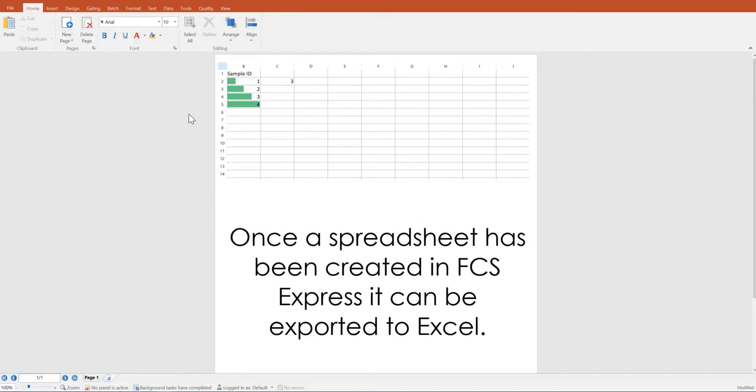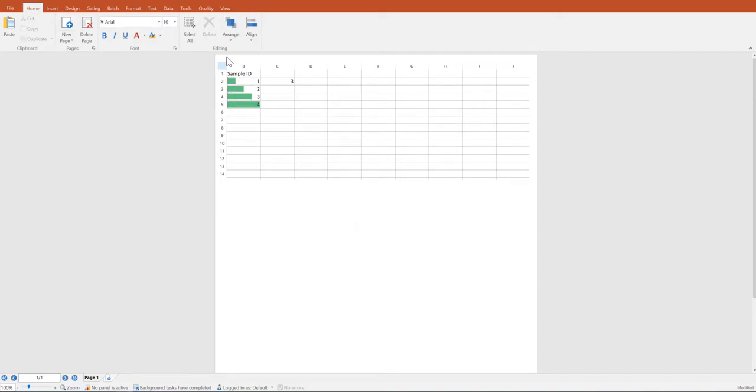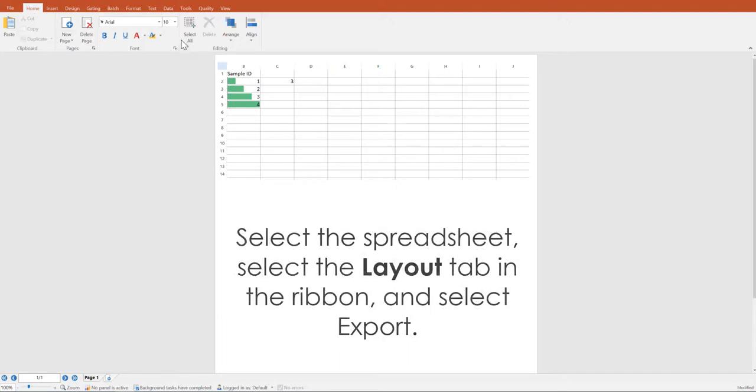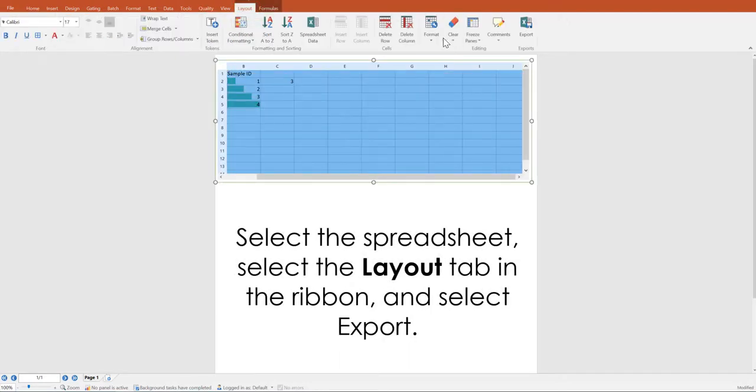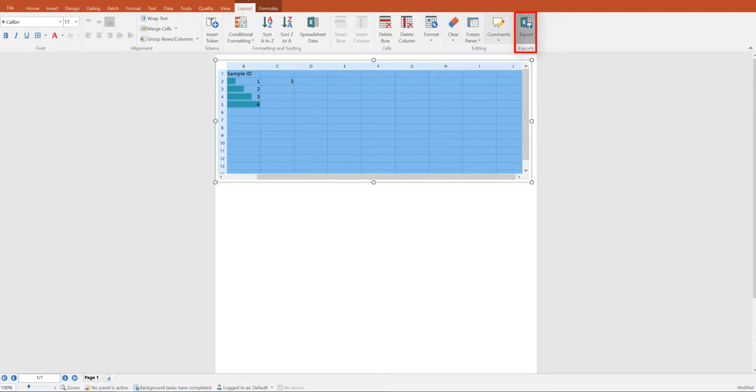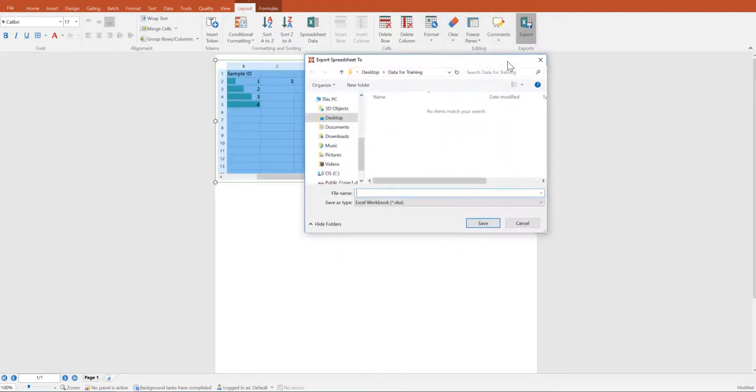Once a spreadsheet has been created in FCS Express, it can be exported to Excel. Select the spreadsheet and from the layout tab in the ribbon, select export. This will give you the option to create a name for the spreadsheet and select the save path as well as the file type.